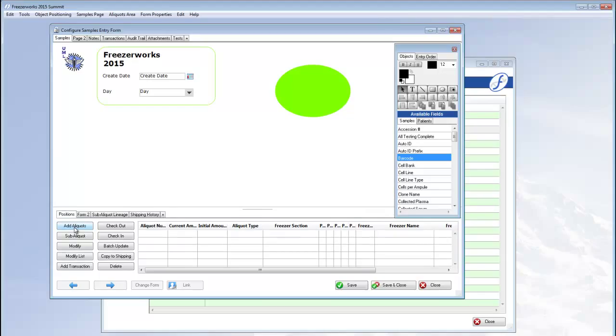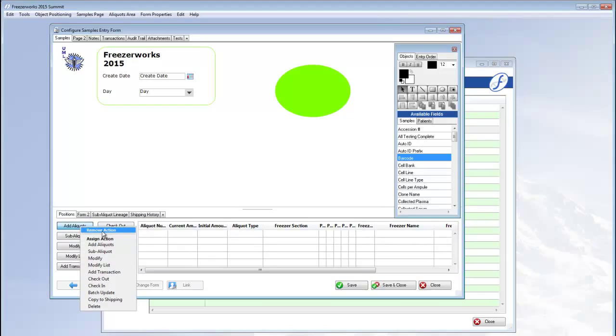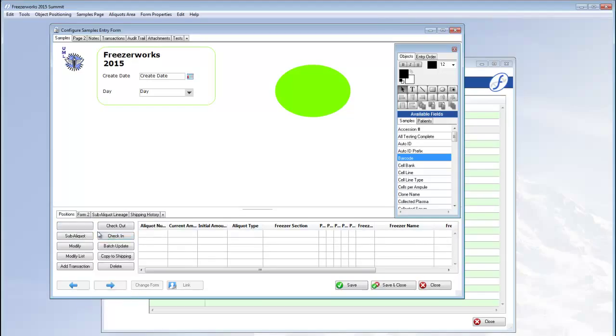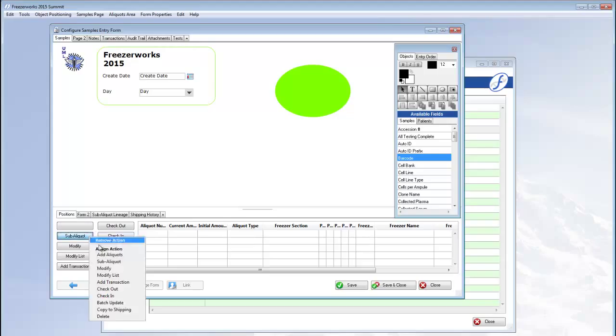If you click the action buttons individually, though, you can remove them or assign the actions to different buttons.